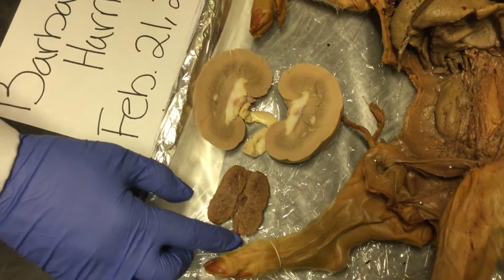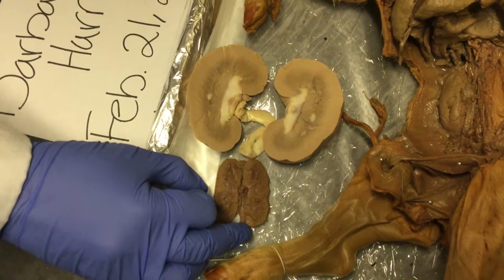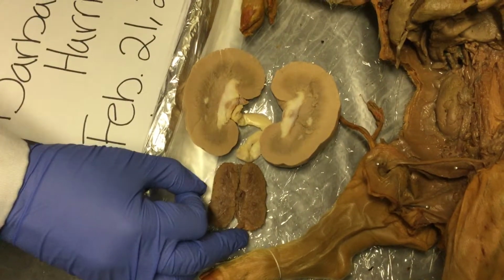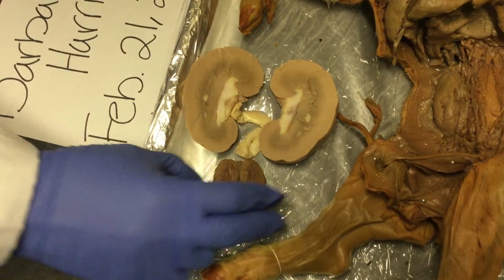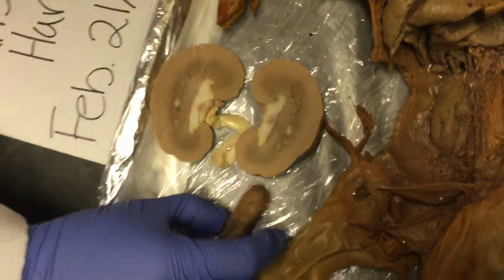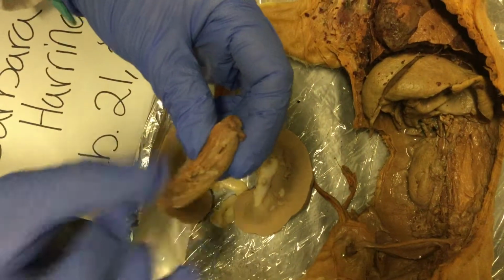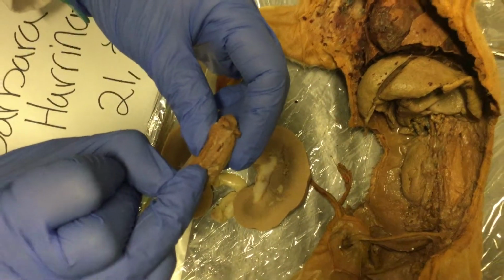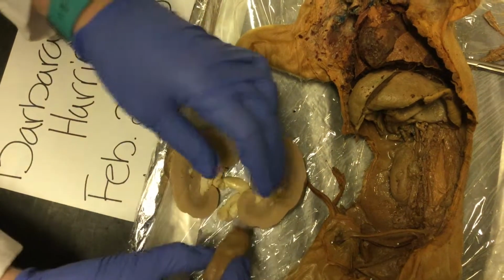Right here with the pig kidneys that I did remove, as I said, I was able to find the renal artery once I removed it, so that's this little flap. Right here, the renal vein would be a little bit harder, but it would be right here. We can almost see a little tiny vein at the top right here, but it's really hard to see. Again, these are a lot smaller.